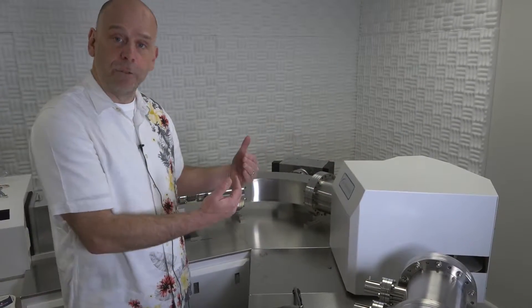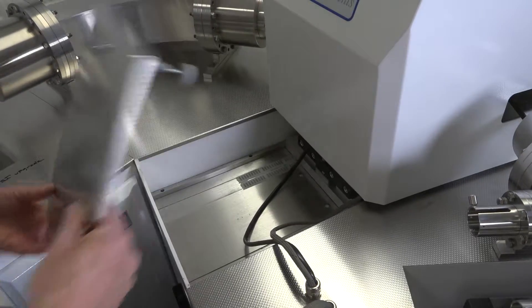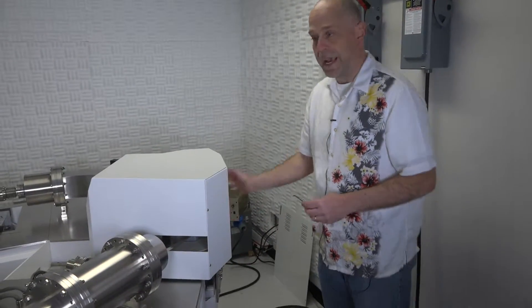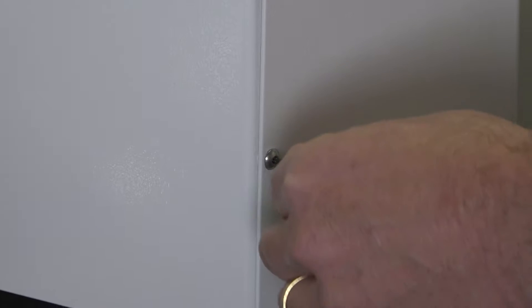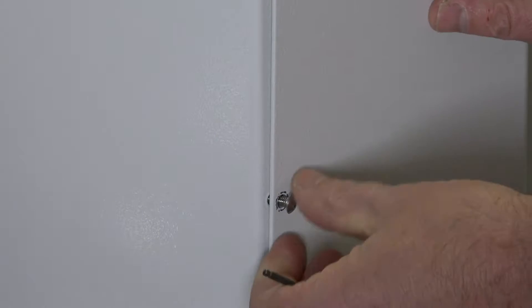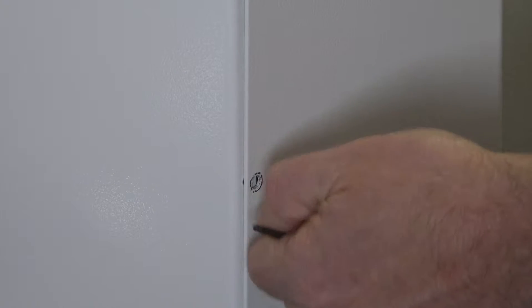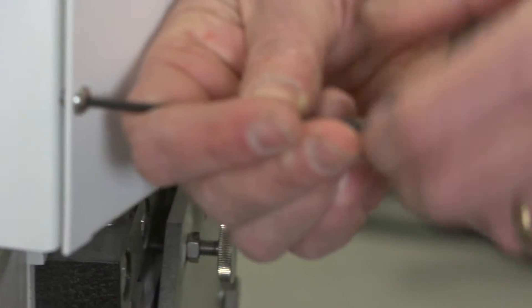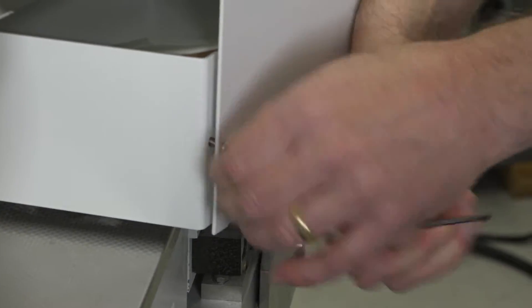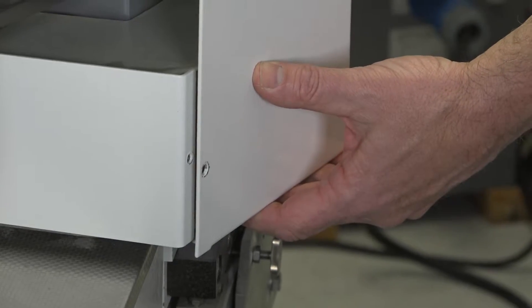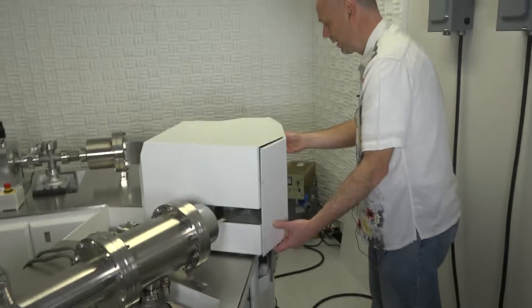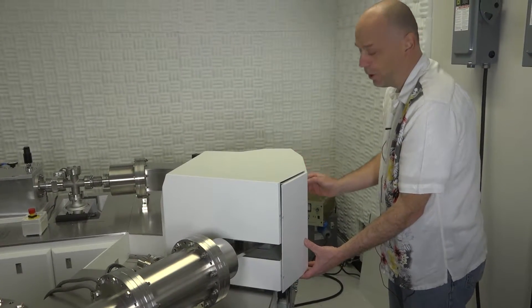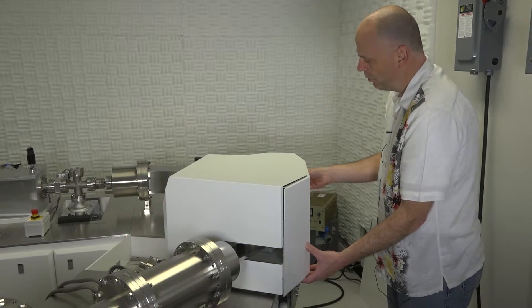Now we're going to remove the magnet and slide it forward. The first step, remove the little panel. You need an Allen wrench to remove the four bolts on the back of the enclosure of the magnet. You'll need to support the bottom of this cover because it will fall once you remove the last screw.